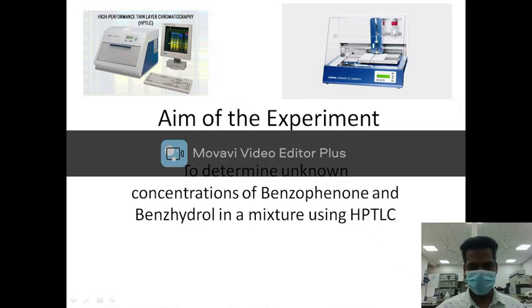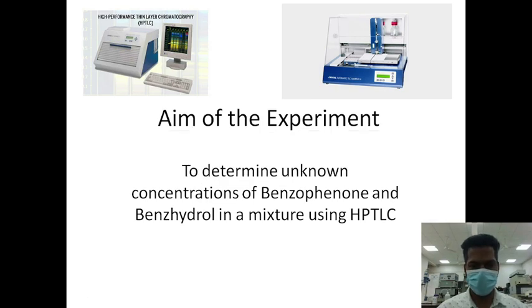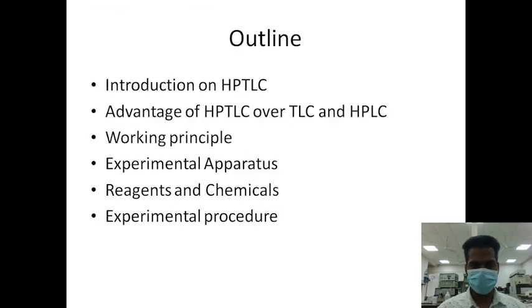Hello, I'm going to talk about the experiment performed in HPTLC. Our aim of the experiment is to determine unknown concentrations of benzophenone and benzhydrol in a mixture using HPTLC. So here is the outline of my talk.